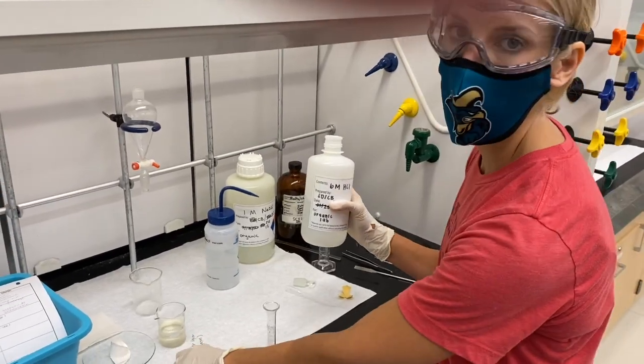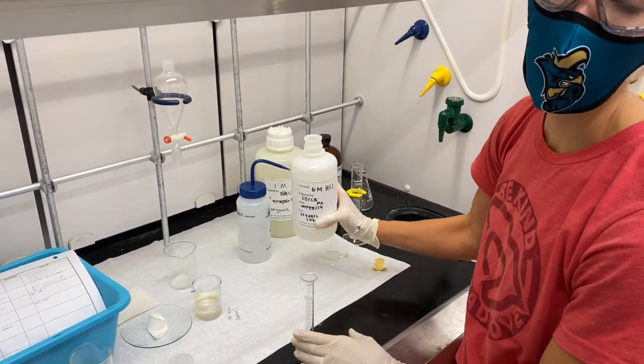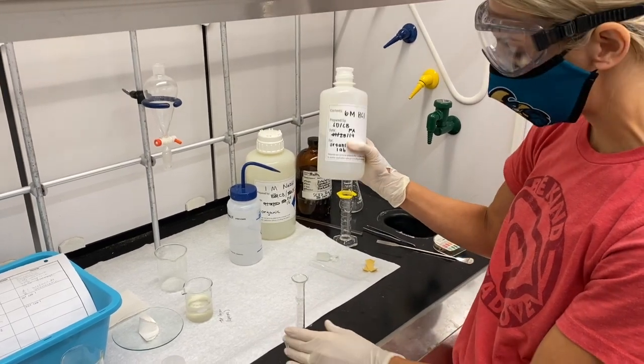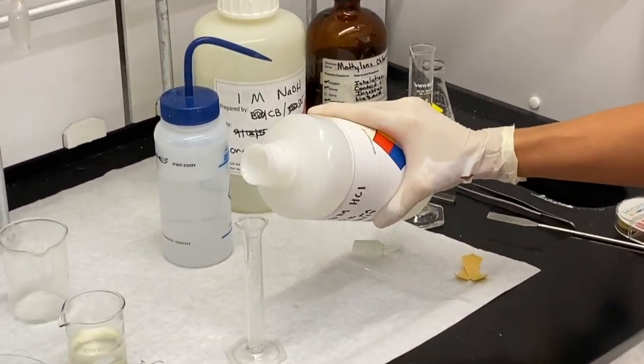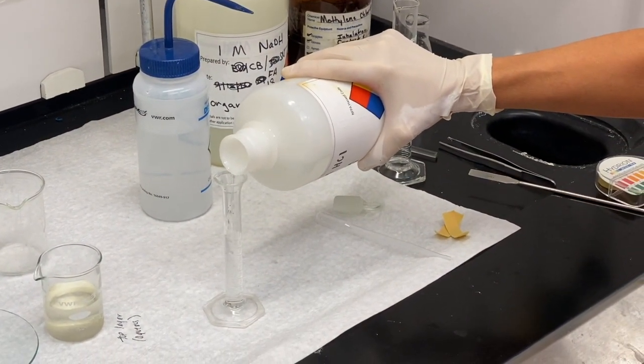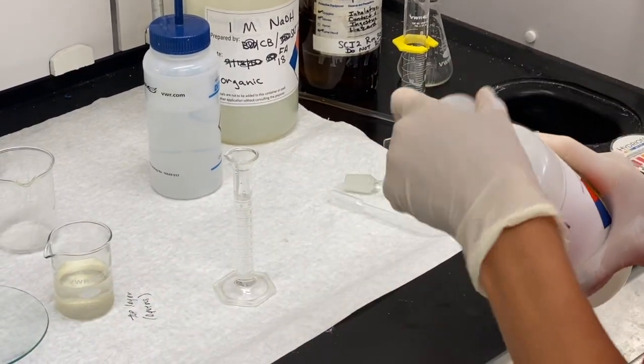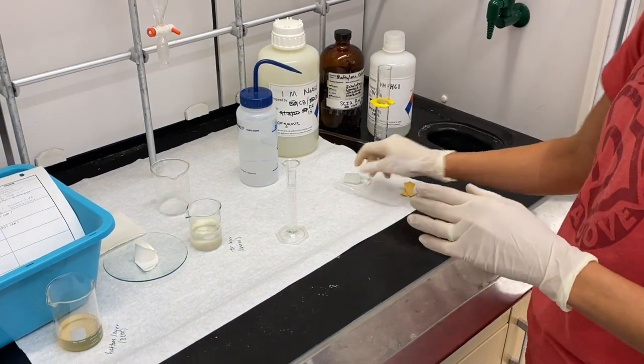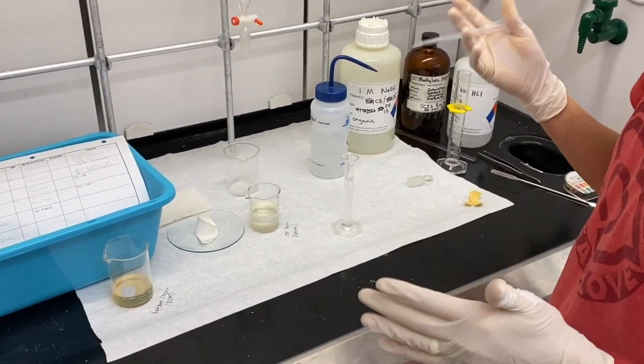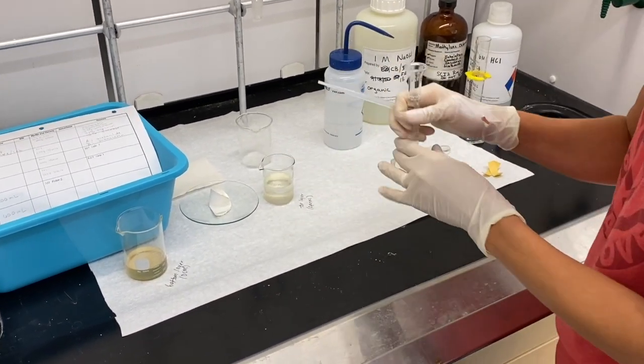Now we need to acidify our aqueous layer, which consisted of our sodium hydroxide. We're going to use HCl to neutralize that, and we're going to use about 10 milliliters. We're going to make sure and go slow, because acid-base reactions are exothermic and vigorous, so we don't want to just pour our 10 milliliters directly into this beaker.